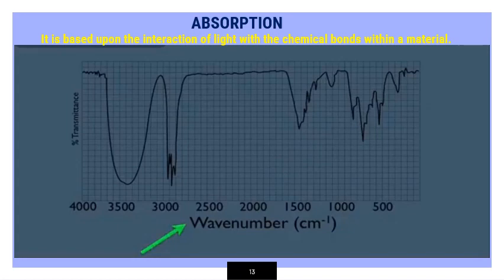Just know for now that there is a connection between frequency of light and wave number of light. And instead of thinking that absorption bands happen at certain frequencies, we can say absorption bands also happen at certain wave numbers. And just in case, let's know these wave numbers typically on the chart run from 4,000 all the way to 0. Some other basics about the IR spectrum here.